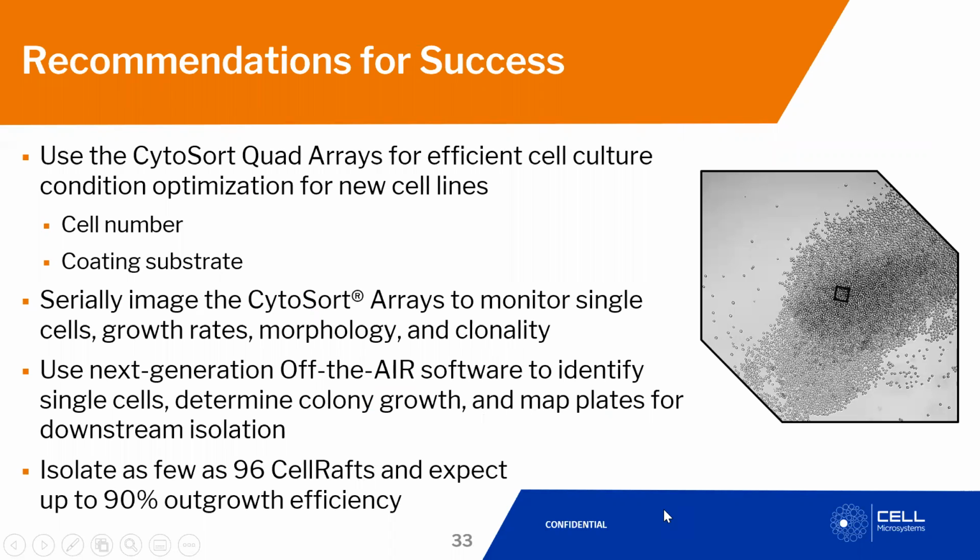So through this process, we have developed some recommendations for success if you're thinking about using our technology to enable your suspension cell workflows.